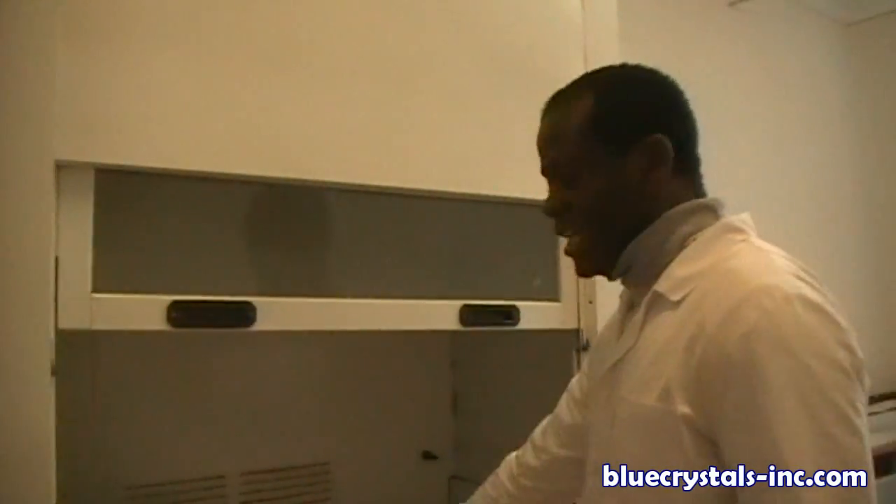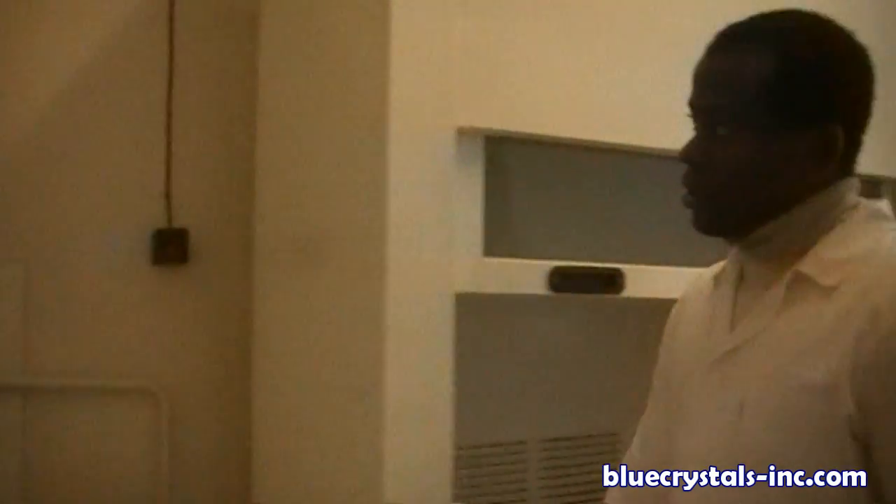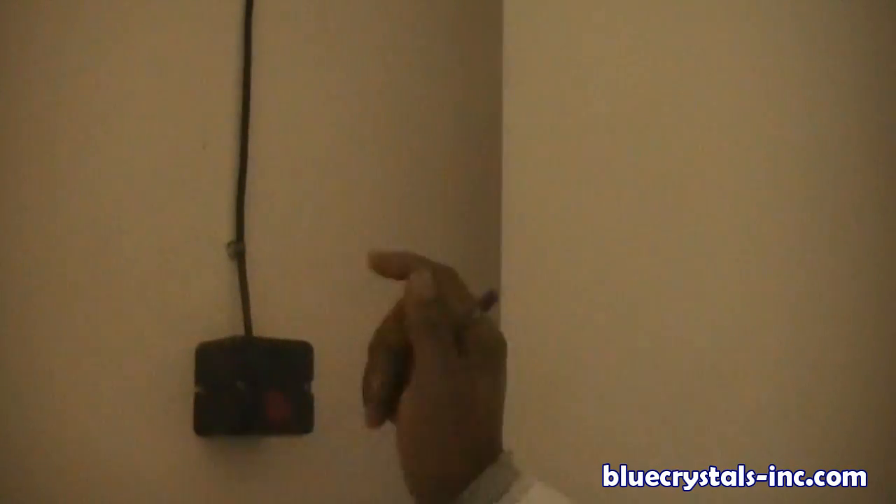This is for heating plates. Here you have the red and the black — you see, it's off, it's on, it's off.